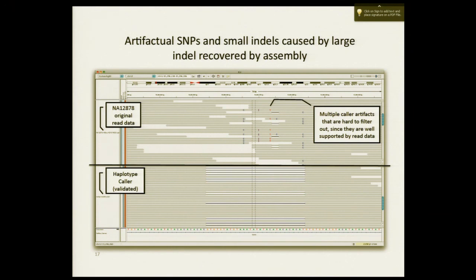Sort of along those lines, are you bringing in the unmapped mates? So we bring in unmapped mates. Basically, we bring in all mate pairs, including the unmapped mates. Okay, so you're using the pairing to maybe get even larger. Yeah, it helps some, but it's not going to get the huge ones, right?